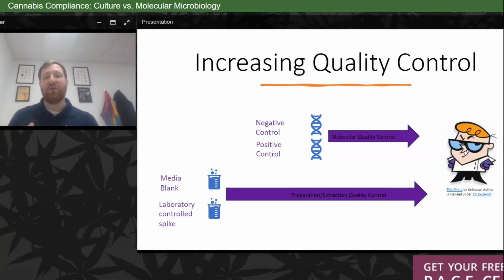And so what we're doing is we get the samples that come out on the plates. First thing we're going to look at is our QC. Okay, my blank is okay, and put an eye on it. And the laboratory controlled spike is within acceptable range, so I have no low bias or high bias when it comes to the method that we put in. Now I have other internal QCs, replicates, and things like that, but at least I know that the start of our process was good.